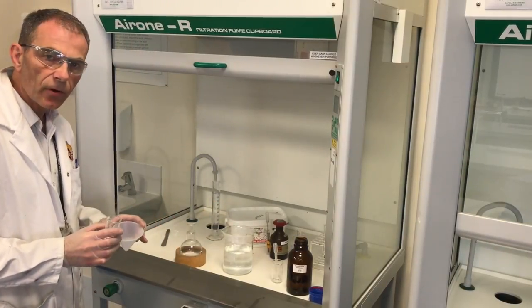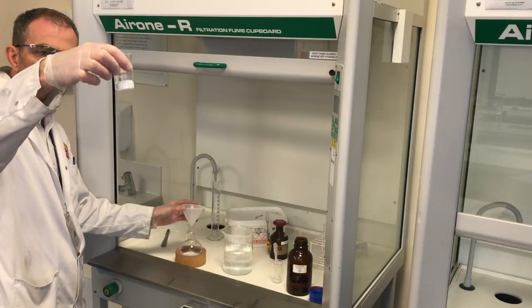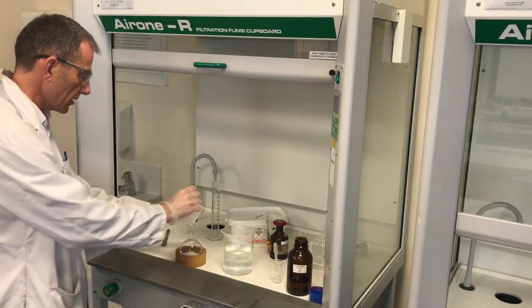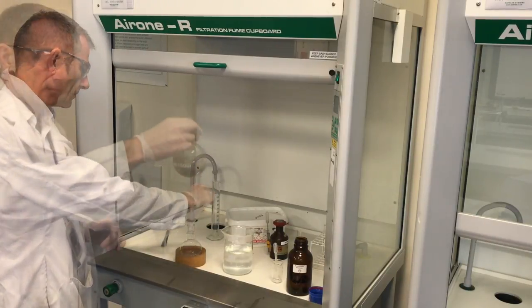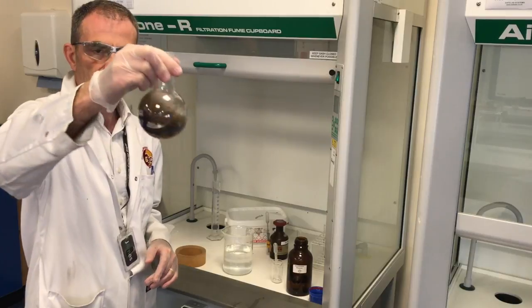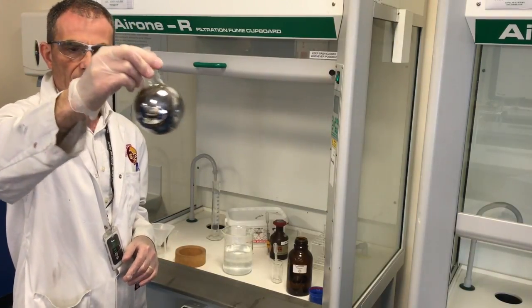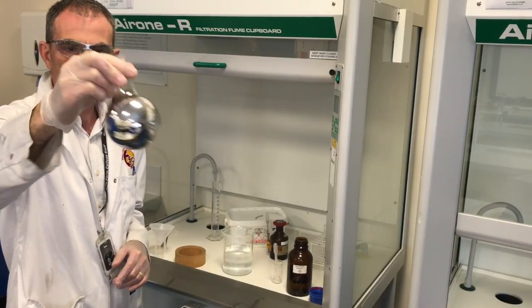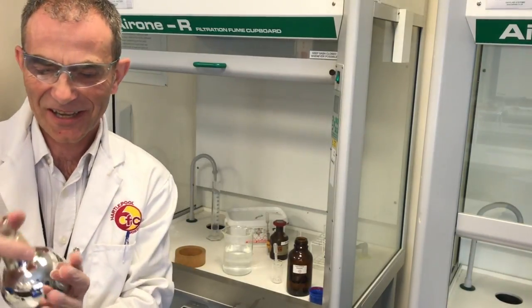The flask's been in the water for a few minutes now. I've got 20 spatulas of glucose powder in the beaker, so I'm just going to pour this in via the funnel. I can see myself — it's obviously working. We'll be chuffed with that.